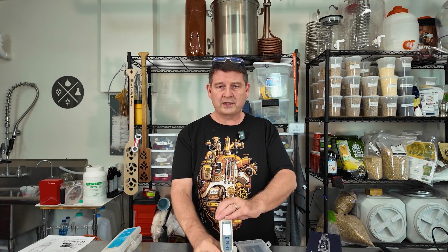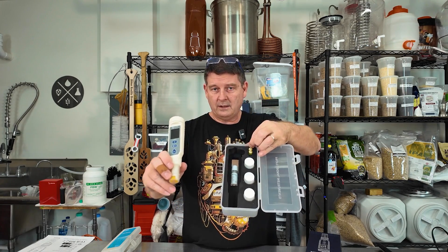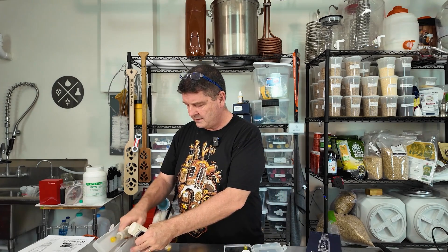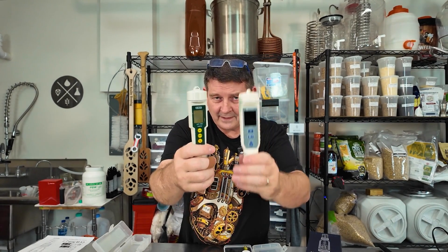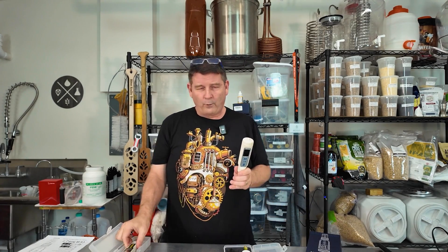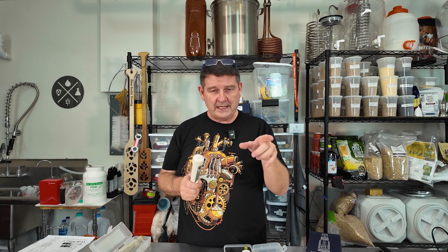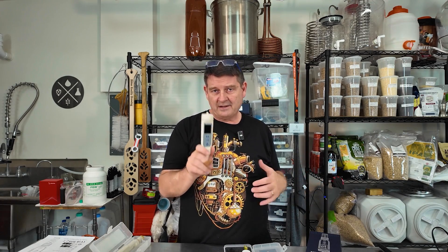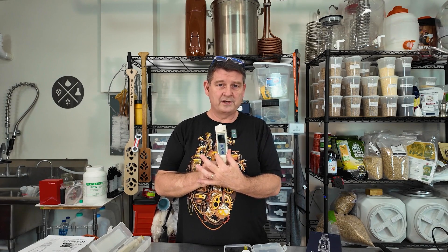I'm taking this out of the container and look, there's more stuff. Let me show you a little size difference here. I mean, beefy, definitely a little heavier. This is going to do me better. I want to say it's 0.01 for the readings, which is what I really like. I love that because usually you pay over $100 for that. This one's running around $60 — sometimes they throw little discounts in there. But yeah, for under 100 bucks you can get a sweet, sweet pH meter.